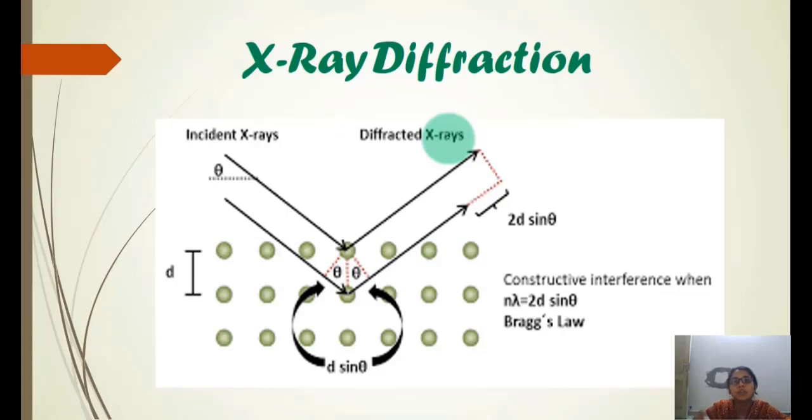In light diffraction you can observe the pattern and make your measurements across that experiment. But in X-ray diffraction, the light is not visible. We should call it X-ray, not light. The X-ray is not visible to you, which means the diffraction pattern would not be visible to you. So how would you introspect this diffraction pattern, analyze it, and infer the crystal structure through X-ray diffraction? That's why X-ray diffraction is different from light diffraction.